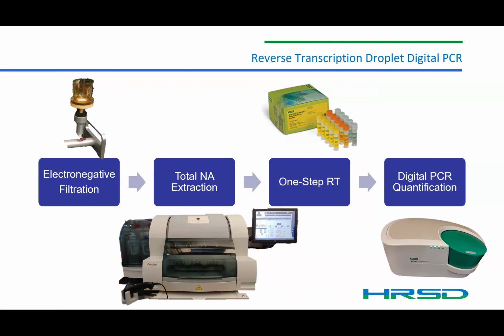And I think I mentioned this earlier. Our preferred PCR method is digital PCR. In our experience, we find digital PCR to be more sensitive in environmental matrices and specifically in wastewater.